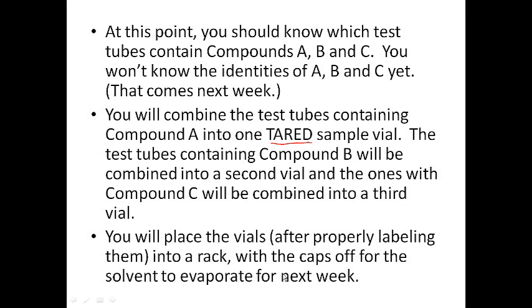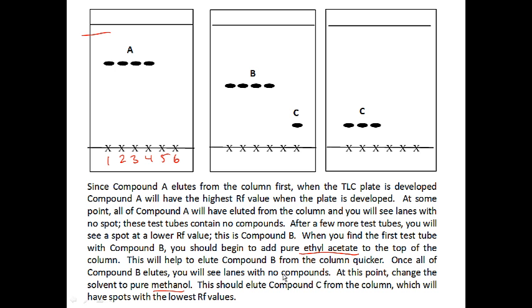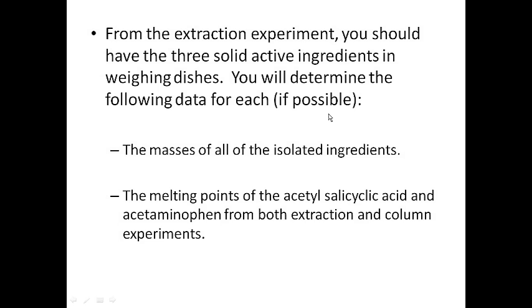So where I've shown you here sort of what I would expect to be the results, you want to make a sketch of this in your notebook, and then you'll make another sketch of it in the lab report that you turn in. And don't copy and paste mine when you put it in the report. Sketch what yours actually look like.